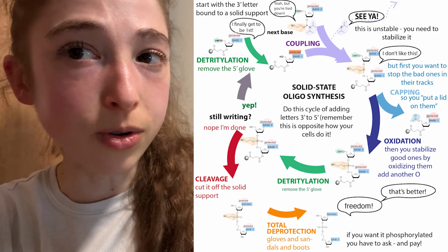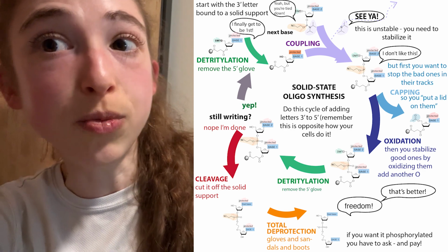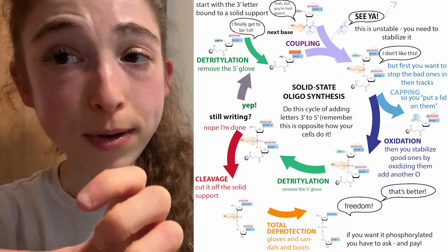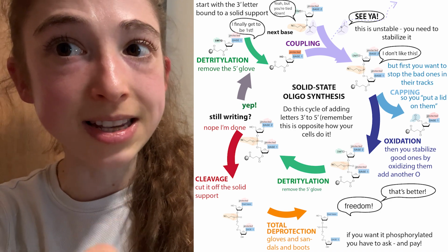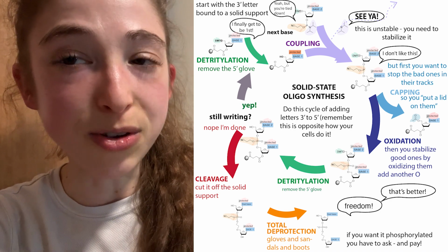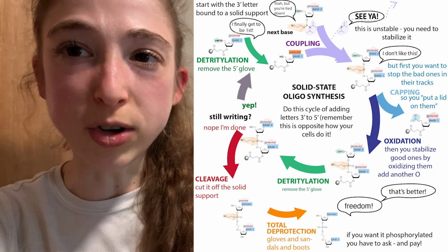It's actually really cool. It looks kind of scary, but all you have to do is remember that basically you want to protect the parts that you don't want to be reacting, expose the parts that you do want to be reacting, and do this over and over and over again until you get the whole sequence that you want. And then you gotta clean things up. So let's look at a little more detail.